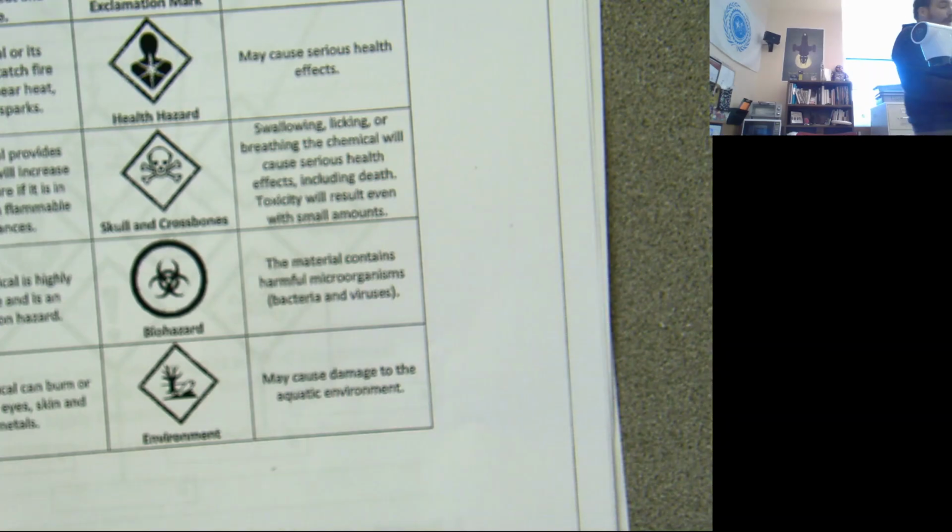Everywhere you might work that will have anything like this, there's training that everyone has to go through to make sure that at least there's been an attempt made to teach you guys what these symbols do and what the chemicals are that are connected to those symbols. So the gas cylinder is the first one. Does anyone know how to take a guess at what it would mean to put a gas cylinder image onto something like that? Yep, Mahib.